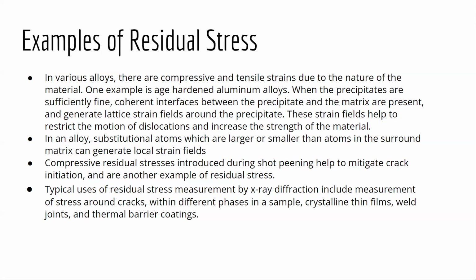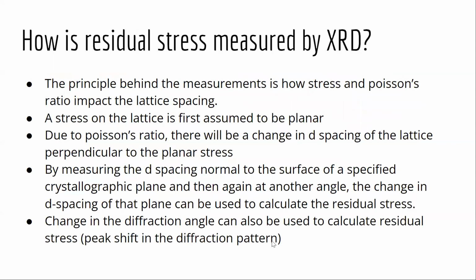You can introduce compressive residual stresses at the surface from shot peening, for example, and typically we use residual stress measurement by X-ray diffraction to measure stress around cracks, within different phases in a sample, crystalline thin films, welded joints, and thermal barrier coatings.